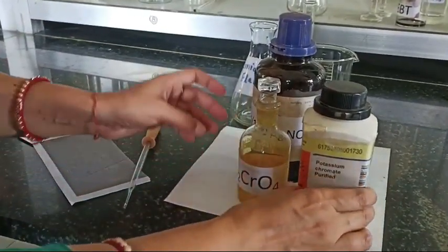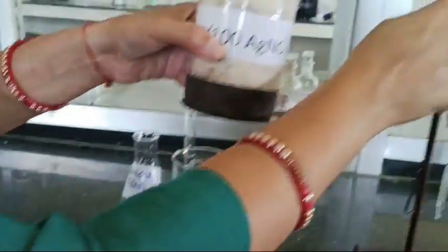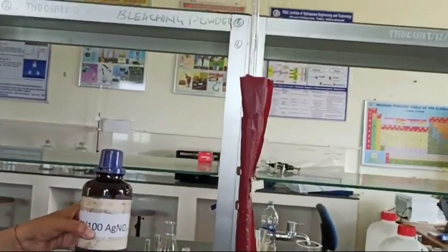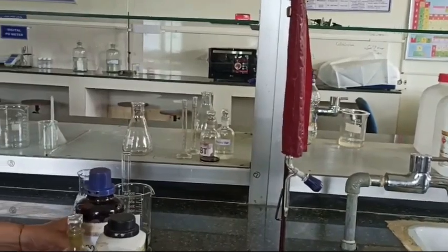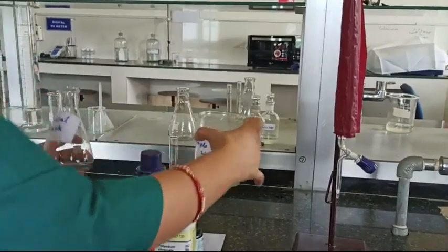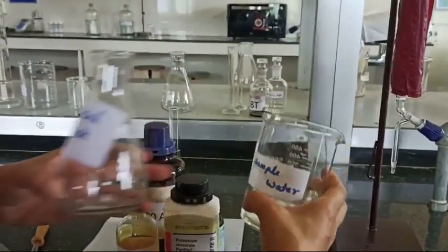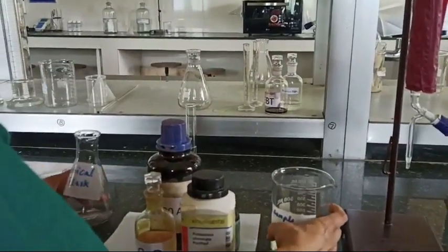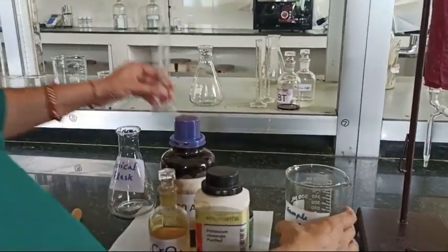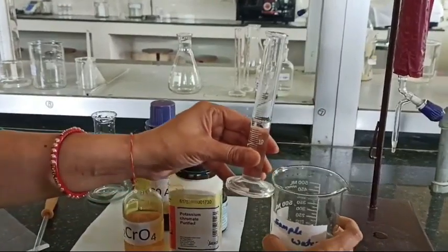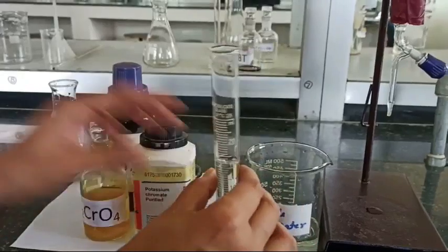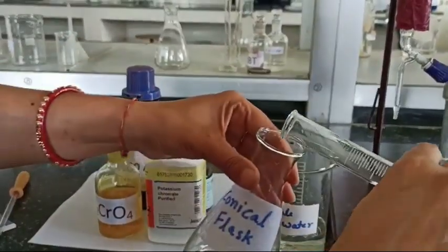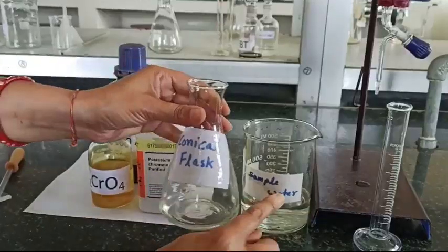K2CrO4 is used as an indicator here in this experiment and this N by 100 AgNO3 is used for titration. This burette is also covered with the colored paper. Here is the sample water. Sample water is nothing but it is containing NaCl solution. So I have measured 15 ml of this sample water which is containing unknown concentration of NaCl solution.